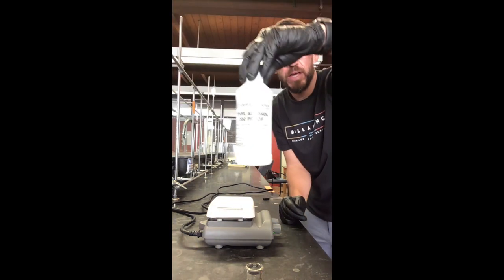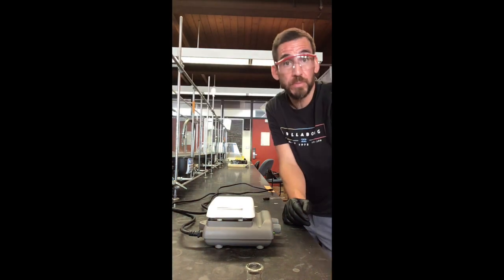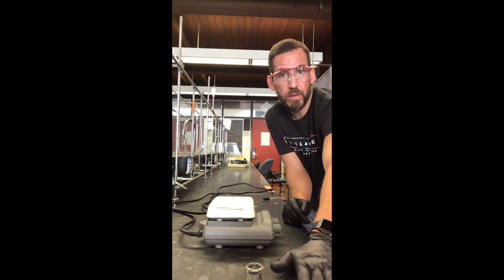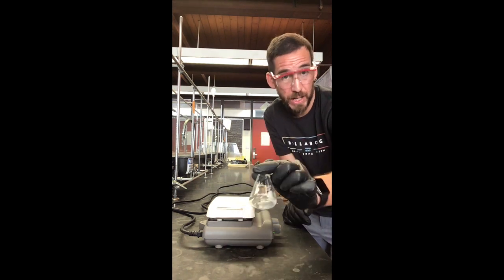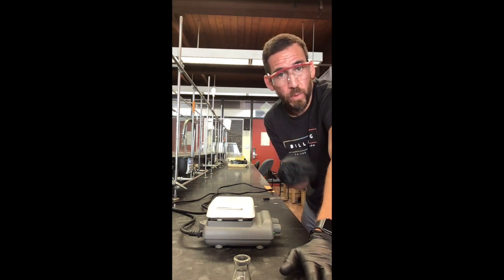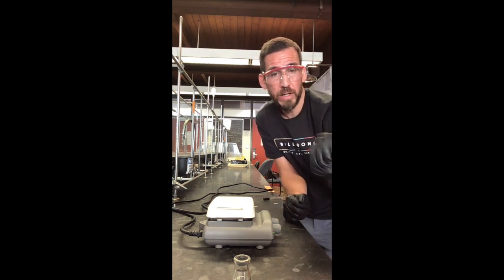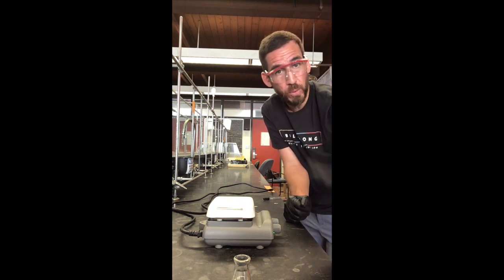So here's ethanol right here. 200 proof means that it's 100% ethanol. And the key here was, remember, we want to dissolve it in the minimal amount of hot solvent. Okay, so remember, solid materials tend to be more soluble in hot solvents, right? And so if we dissolve it in hot solvent, as it cools down, the solubility of that substance will decrease in that cooler solvent, right?